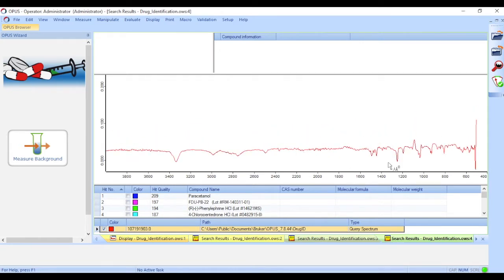phenacetin. One of the hardest parts about doing analysis like this is knowing when to stop by being able to tell when there is no signal remaining by evaluating the line. In this case, there are no clear peaks in the signal. It's relatively flat, and any ups and downs are due to noise in the signal and not a third component. As you gain more experience with drug checking, you'll get more confident in deciding when to stop looking. But if you're ever unsure, you can always ask another technician for a second opinion.